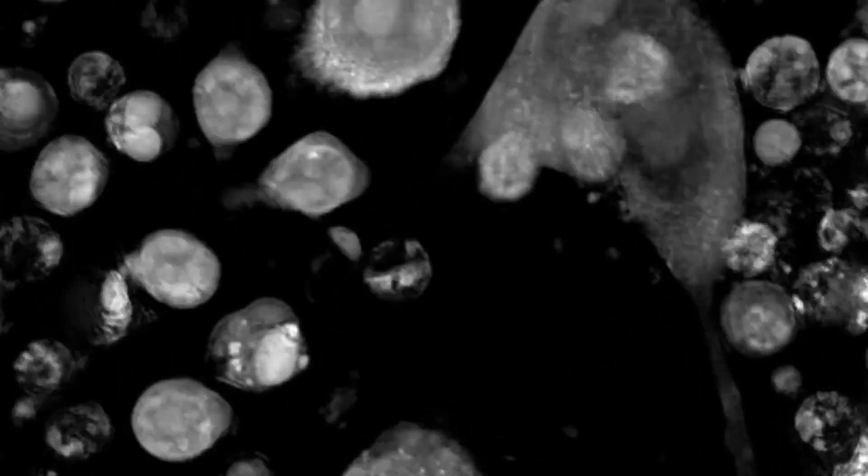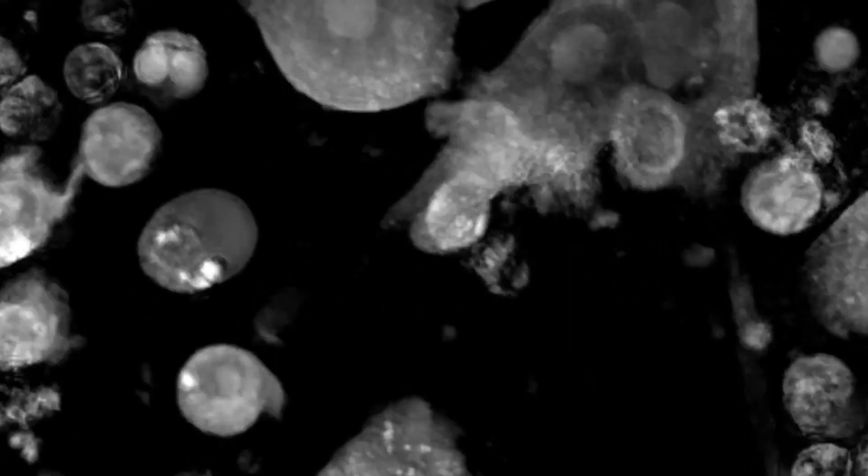The really important thing here to remember is that the amount of energy we put in is so much smaller than nearly any other microscope on the market.